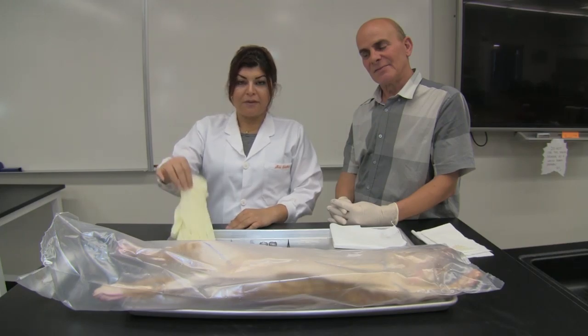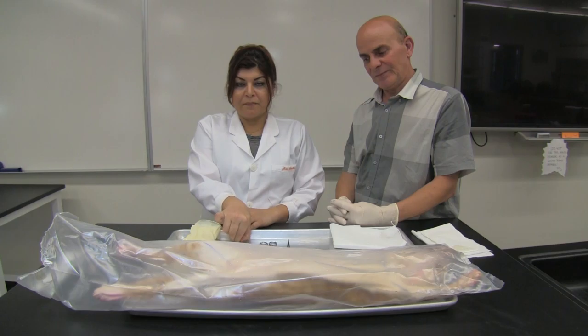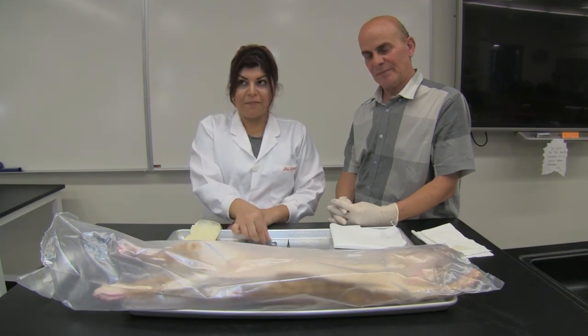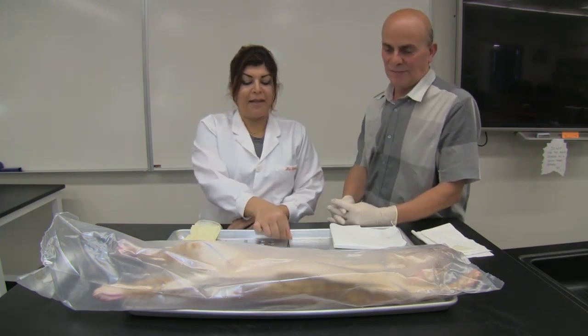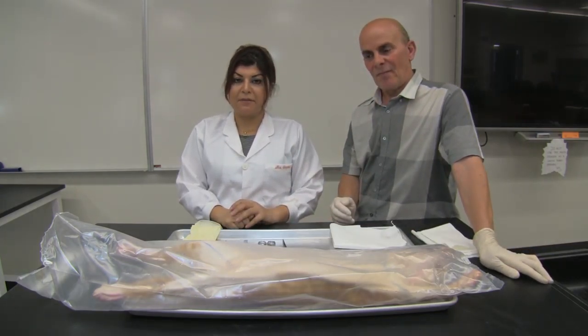The tools you need: gloves, probe, scalpel, scissors, and tweezers. Some paper towel later if you need.